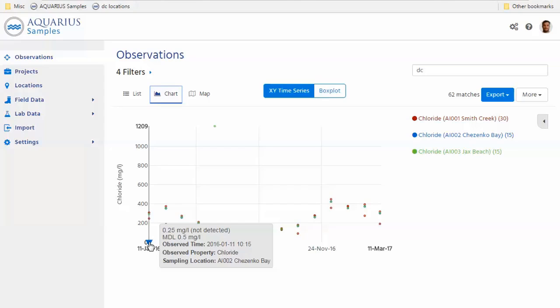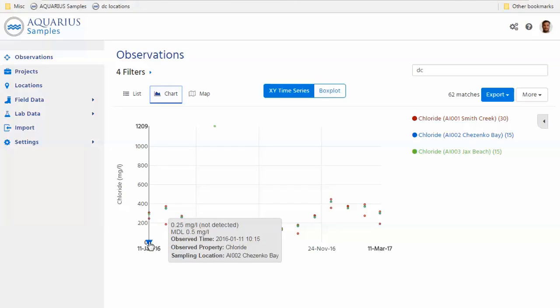You don't have to ever change your data, and you will never lose the information that your non-detect in fact is a non-detect. You will be able to tell historical data, and you don't have to ever change it. In this case, it's 50% what that organization is interested in using for detection limits. But that could be any other setting depending on what your organization needs to do.